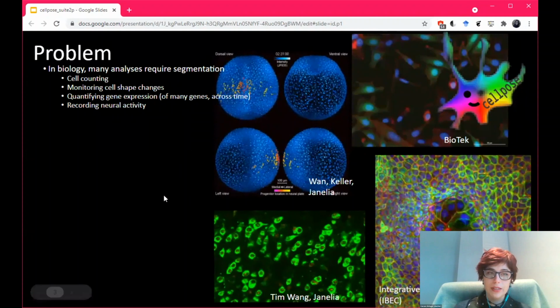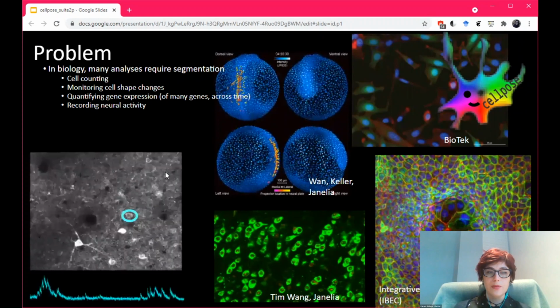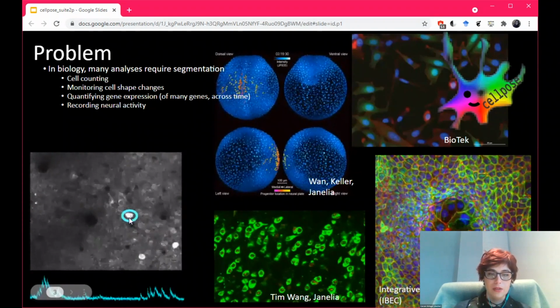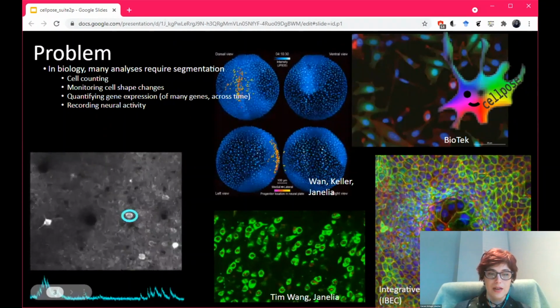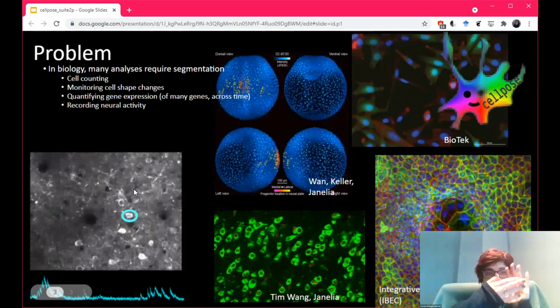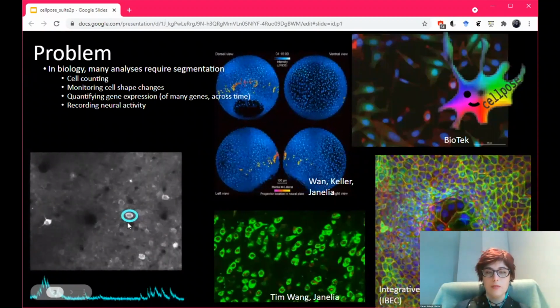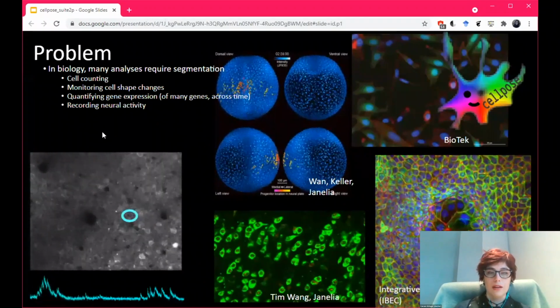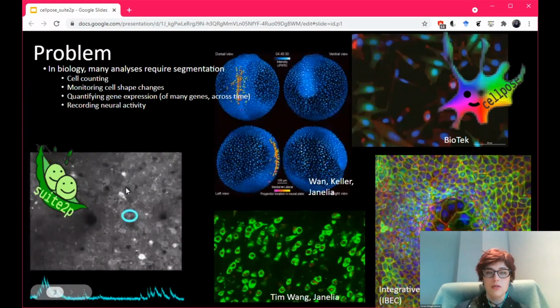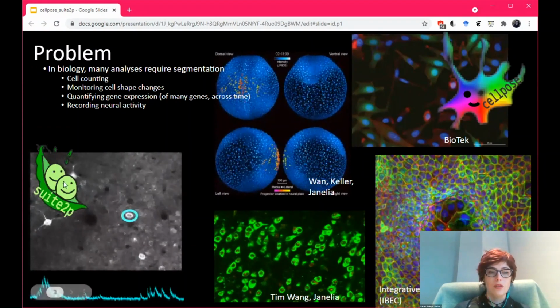Additionally, anatomical algorithms are really helpful, but in the case where you also have information about the cells firing, it's even better. For example, I've circled this cell here and you can see these pixels across time have some sort of time trace. There's additional information here in the time dimension that we can also use to do segmentation. That can actually help us find even more cells than we can find with an anatomical algorithm. So Suite2p also takes into account this temporal information to do segmentation. I'll tell you first about how Cellpose works, and then about how Suite2p works in terms of the segmentation.